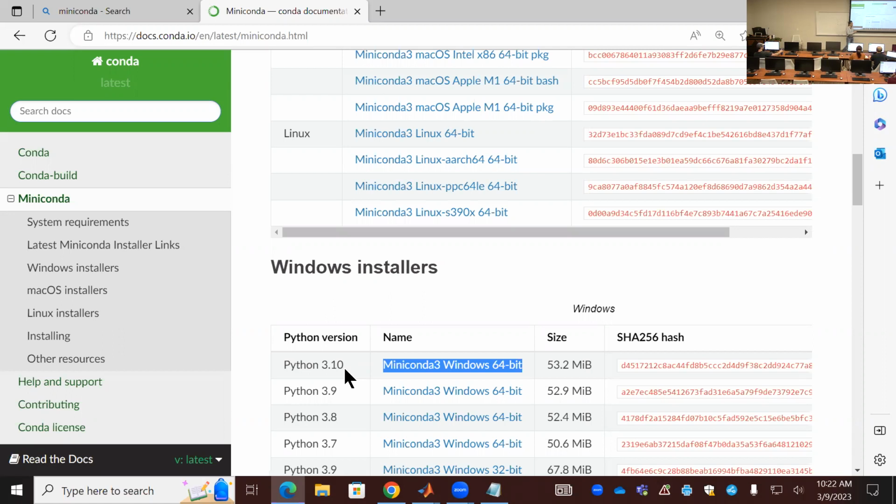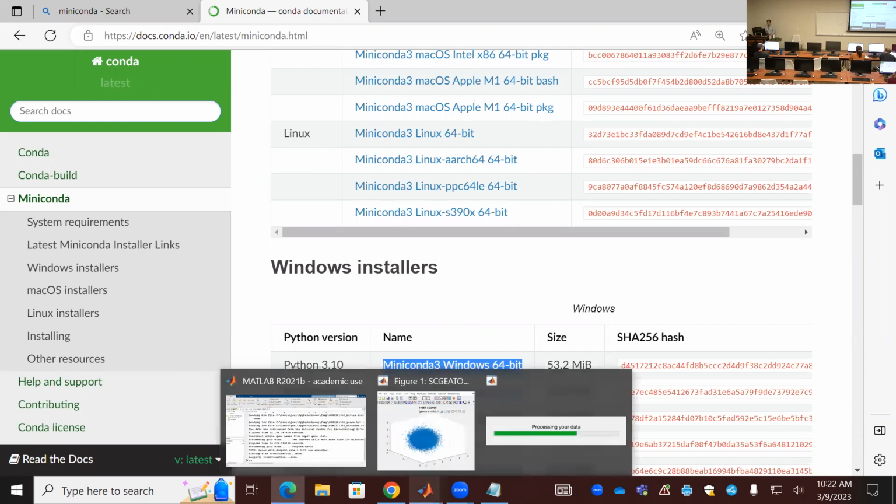By the way, I'm not so sure, but it should work. I have not tested this on a Macintosh machine, but on a PC I'm sure it will work. Well, my t-SNE is still running. I know it will take 5 minutes because of the size of the data. At the same time, I can download this and install.